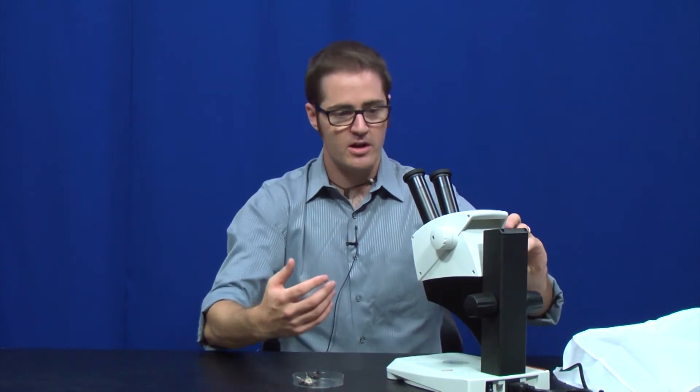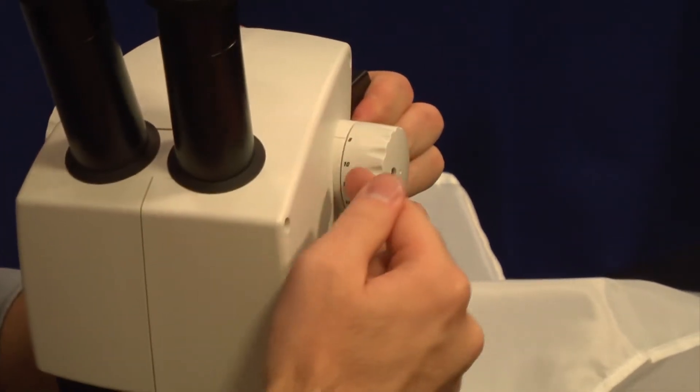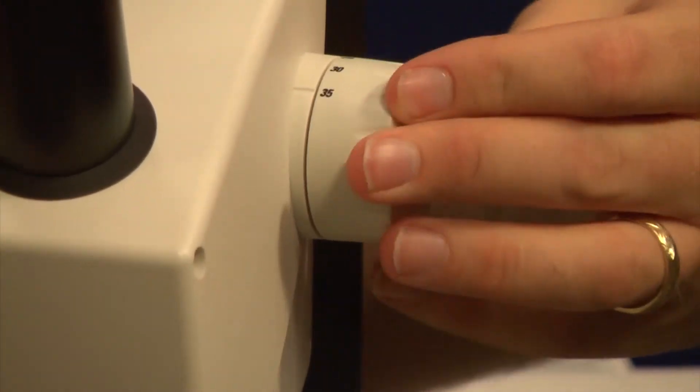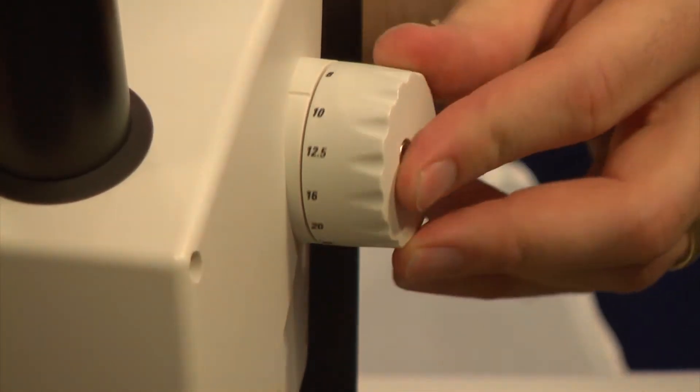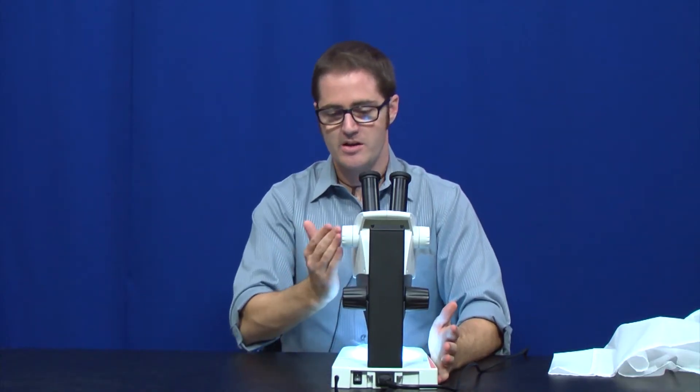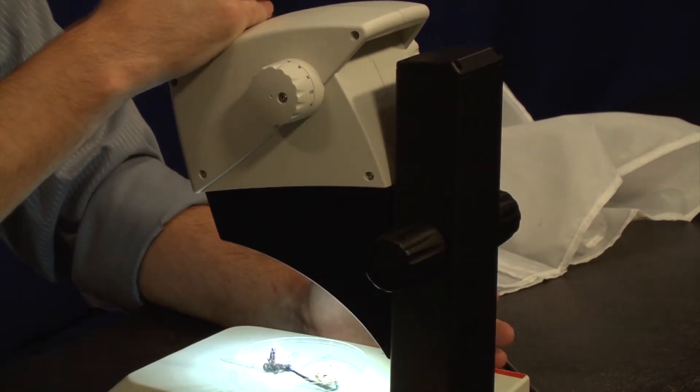The white knob is going to be your zoom. As I twist it, we're going to increase our magnification and decrease accordingly. On the right-hand side of that white knob, there are markings for how much magnification we're using, so the student knows where they're at. The magnification range for the EZ4 microscope is from 8x up to 35x, and that's fixed with a 10x eyepiece.